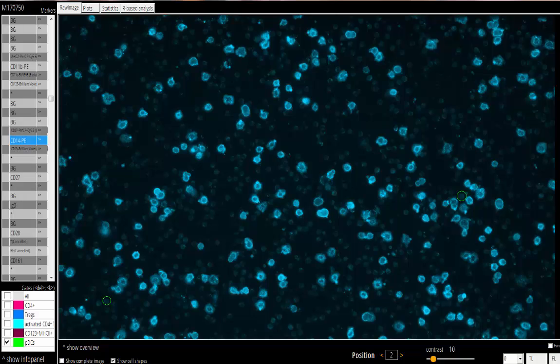Now, if 37 biomarkers are not enough for you, you could analyze as many more markers as you want on the same chip. You could also put your chip into the biobank, wait for, let's say, a year, and stain the next marker after that year. If you don't want to stain your additional biomarkers one by one, you can also design new multicolor cocktails.